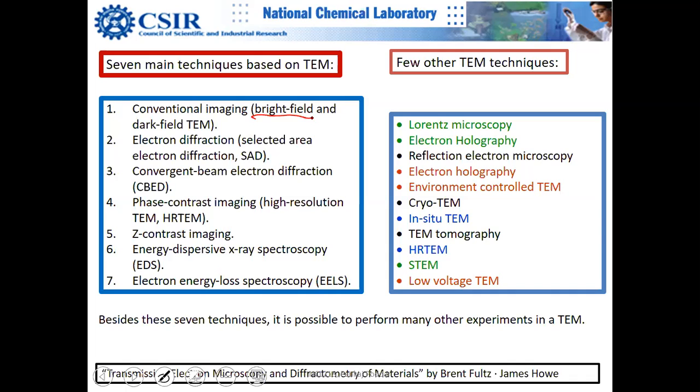And in bright field TEM, you see the particles as dark color in the light background, and the contrast consists of three things: the thickness, crystallinity, and the atomic number, right? So the higher the atomic number, the heavier the atom is, so that is going to look darker, because it will stop more electrons.